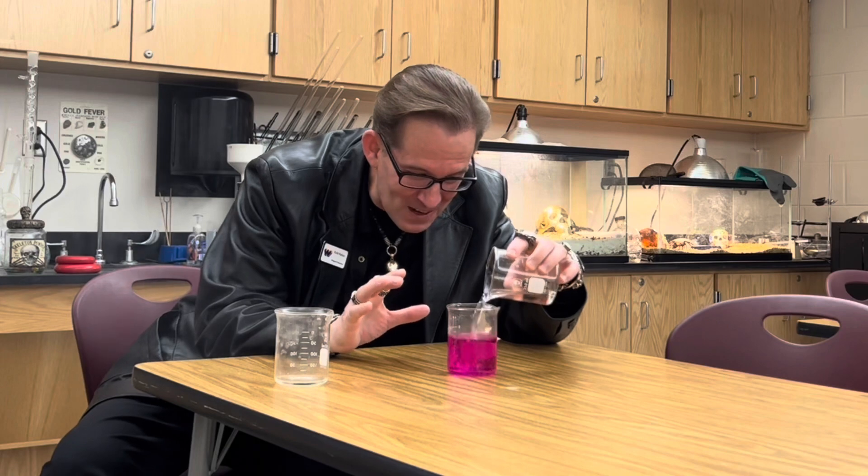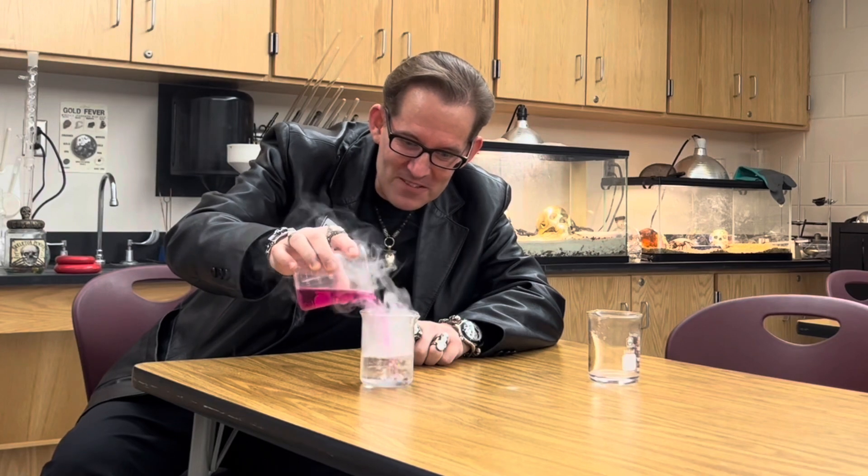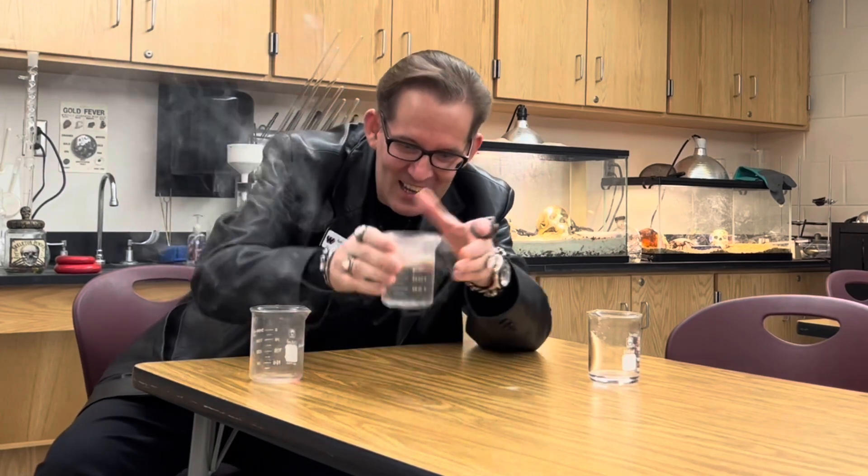Where is that color coming from? And check out what happens when I add this beaker over here. Unbelievable — it vanishes, completely clear again. How did that happen?